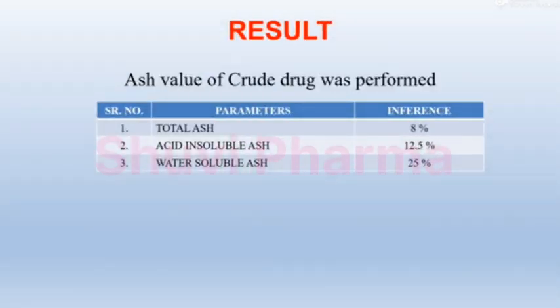So the result: ash value of crude drug was performed. Total ash obtained was 8%, acid insoluble ash obtained was 12.5%, and water soluble ash obtained was 25%.